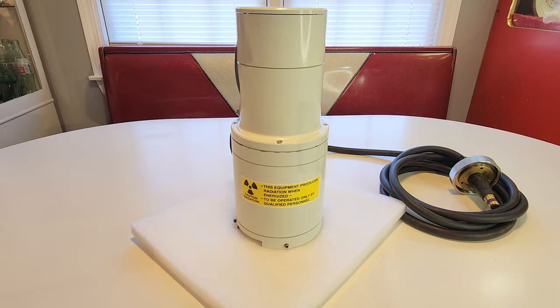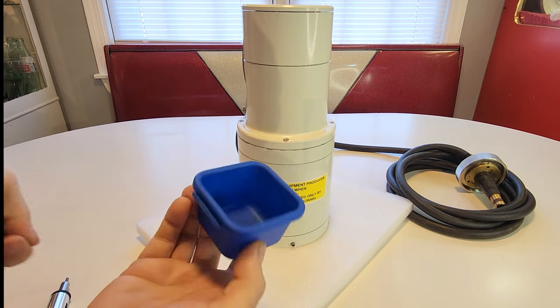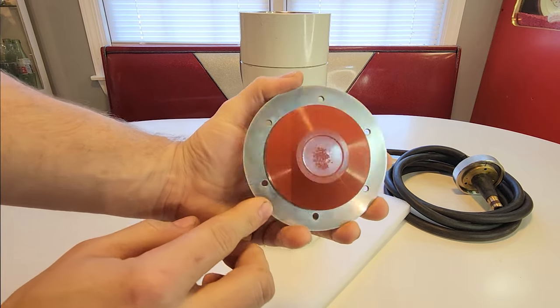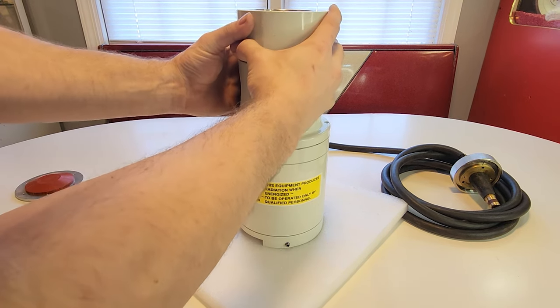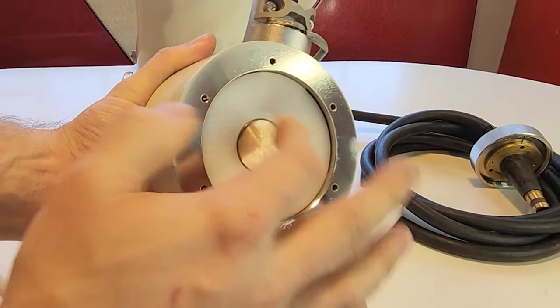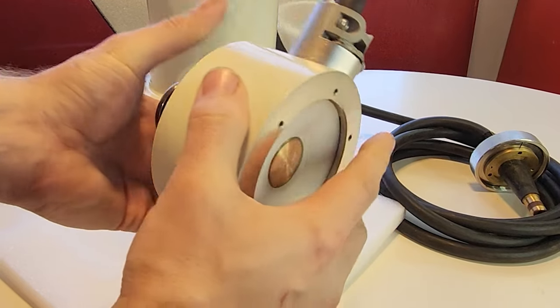First thing we're going to do is remove the top. So we pull this off, keeping hardware in stackable bins as we go. Taking off this lid, I can see a very large silicone rubber seal — this is your large vacuum gasket that seals up the backside of the lid. Lowering it down to show you: this is a very large binary connector. In the center is your main high voltage input with a large insulator, and then your ground output. It feels like silicone rubber inside.